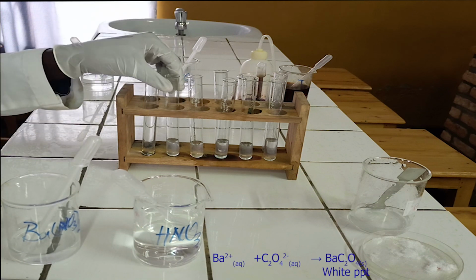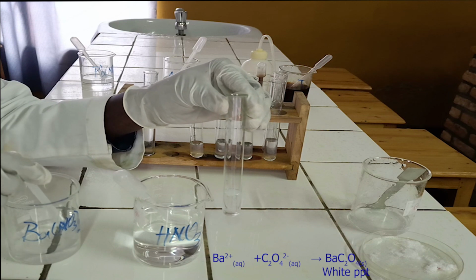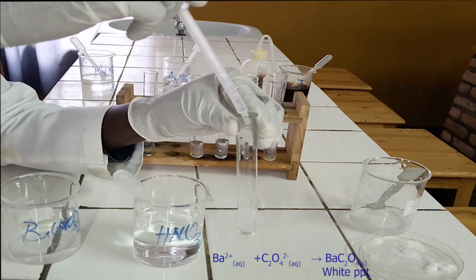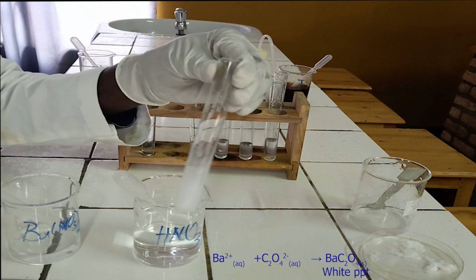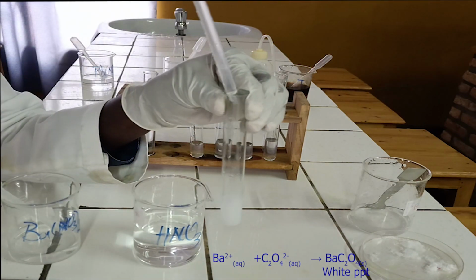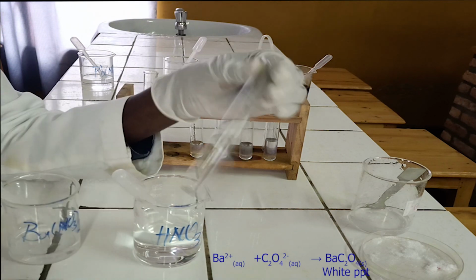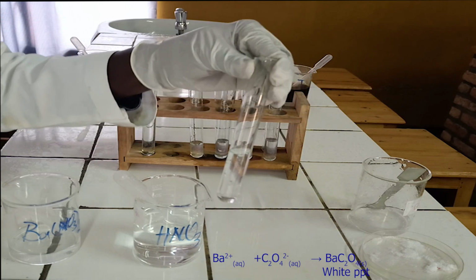To the second test tube, add barium nitrate solution followed by nitric acid solution. As you see, barium nitrate reacts with oxalate ion to form white precipitate. The precipitate formed is soluble in diluted nitric acid without effervescence. Below, there is the ionic equation for this reaction.